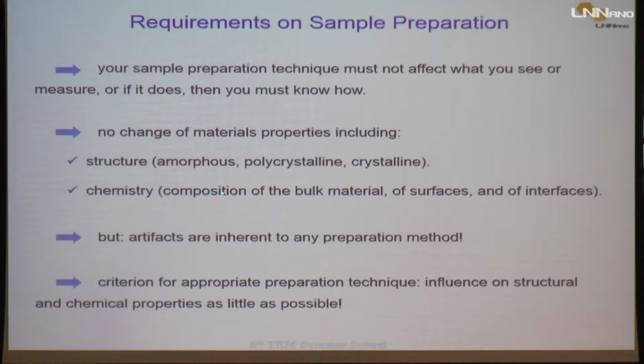Okay, when you do an elemental analysis, you have the composition of your bulk material. But when you make it very thin, in very small parts, this distribution of components may change because of the migration of some elements to the surface or to the core of the material, and so on. It's very important to be sure about what you have, and in which way your material is changing.